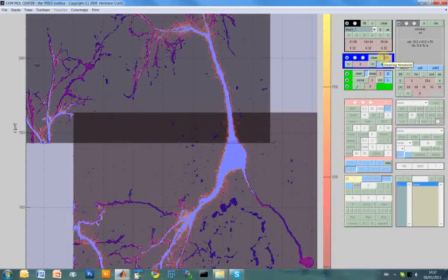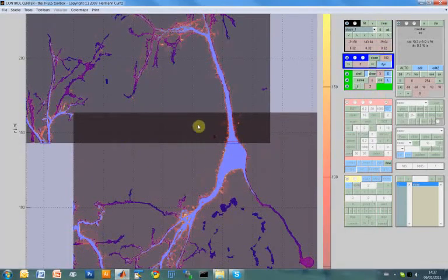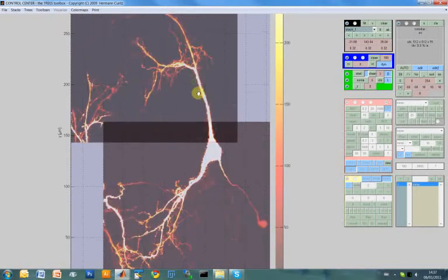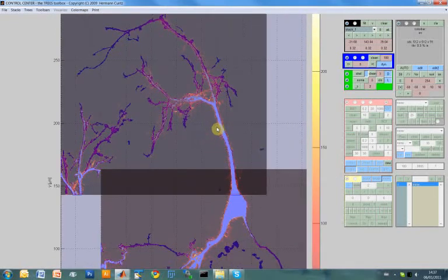This means that everything that are connected pieces that are altogether smaller than 100 voxels will be cleaned away. So I can press this button and you will see all the small dirt here is now gone. Of course, some of the real dendrite branches are gone as well.